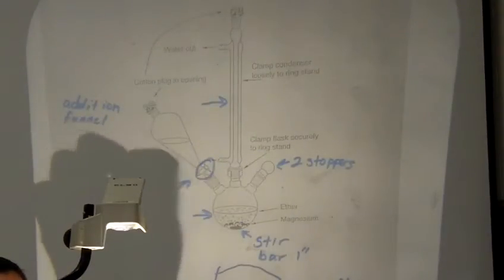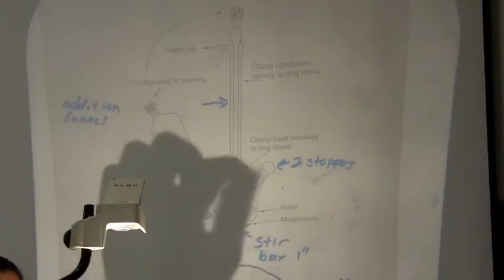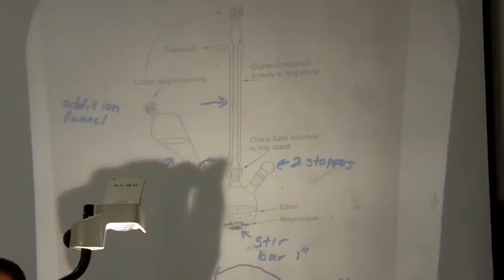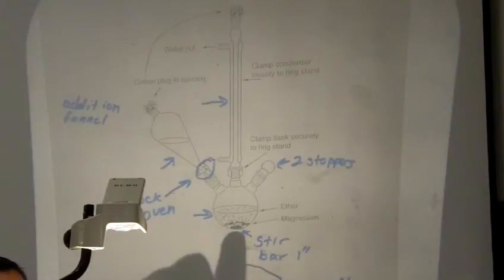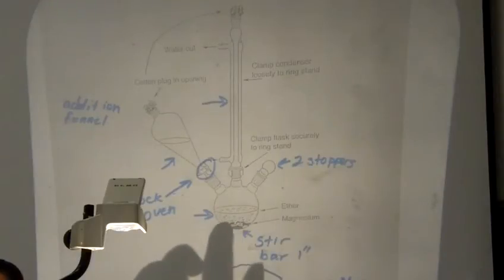You're going to add a small portion of alkyl bromide, add some iodine to the reaction, and we're going to help you get the Grignard reagent formation started, okay? What you're going to look for is on the magnesium itself, it should start getting kind of bubbly and kind of a grayish color.